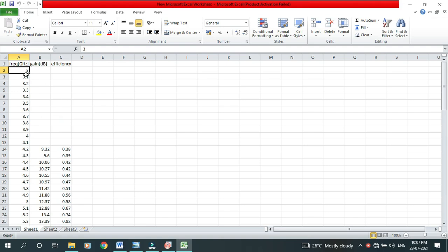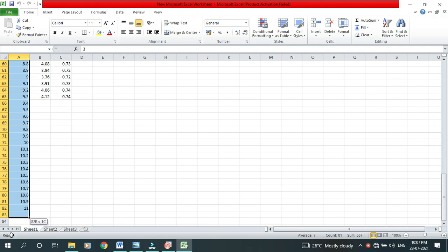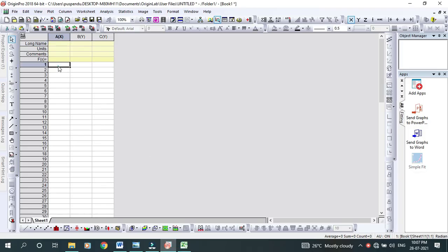So I think the selection is not done properly. Okay, so the first column is selected. I'll copy it and paste it here.